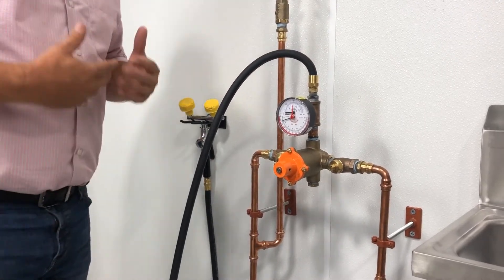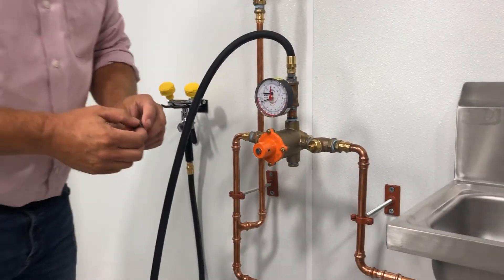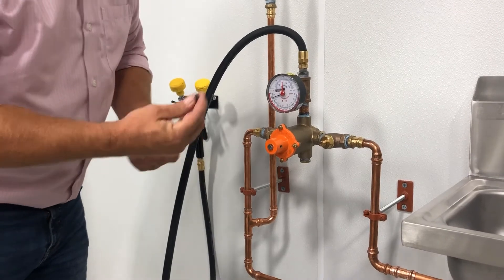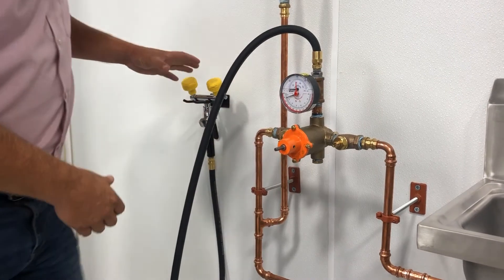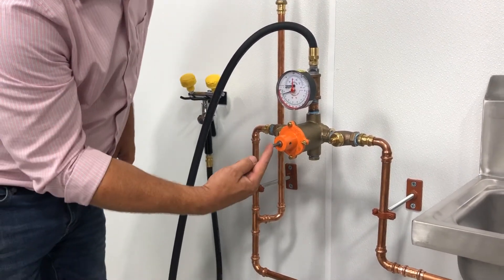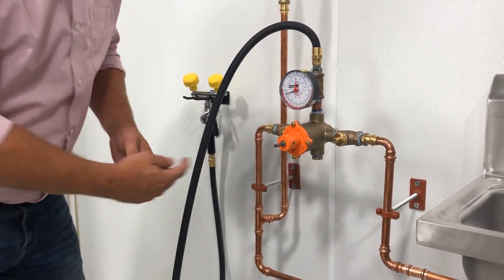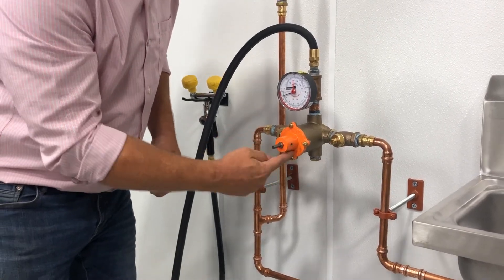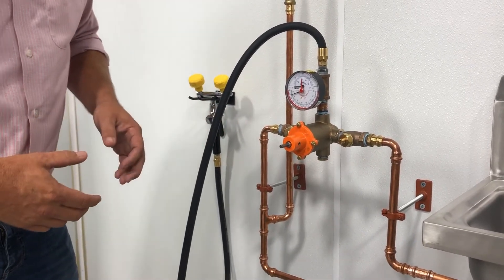Now if you're looking at setting this, one thing you're going to notice is that this is a little bit different. We have an Allen wrench screw, but this is going to be vandal-proof. This will come with your device — you'll insert it into the stem itself, get a sufficient amount of water running through this, and you're going to turn this Allen wrench key in eighth-inch or quarter-turn intervals: counterclockwise to make it warmer, and clockwise to make it colder. You're going to want to stay in that 60 to 100 degree range.